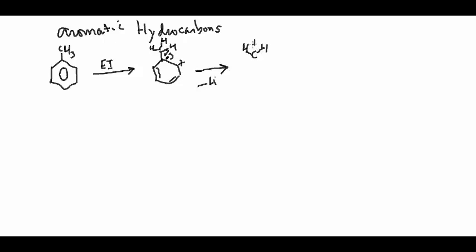And that results in a benzyl cation. Put the plus charge over here the way I'm showing the electron shift. Right, basically that.